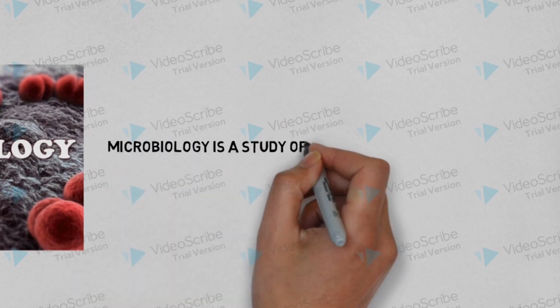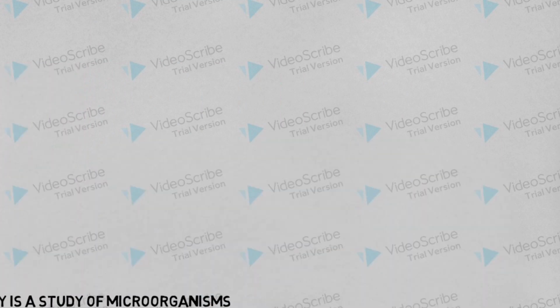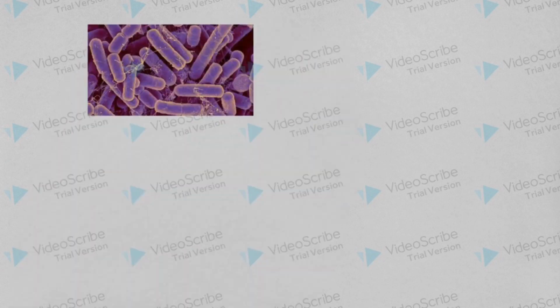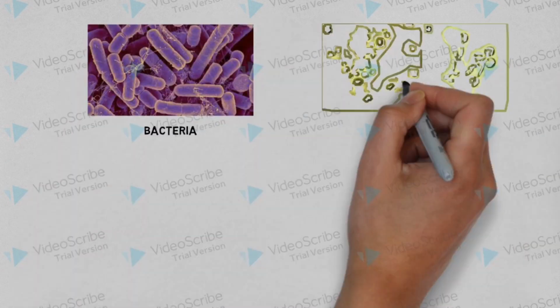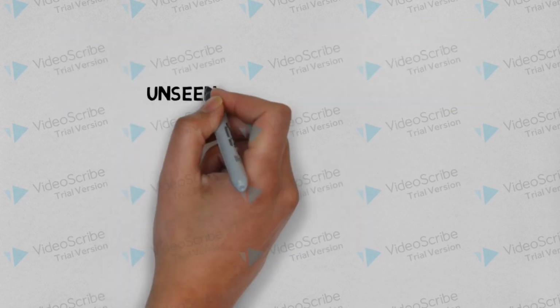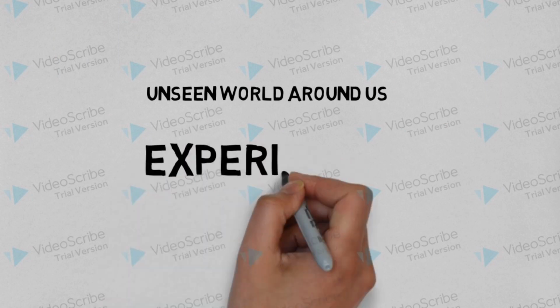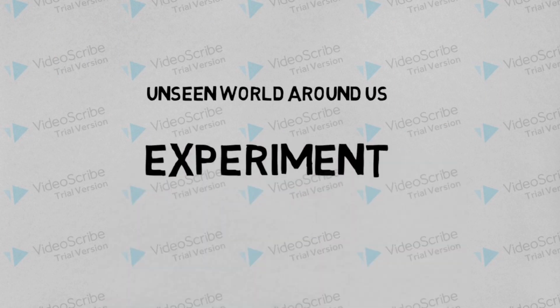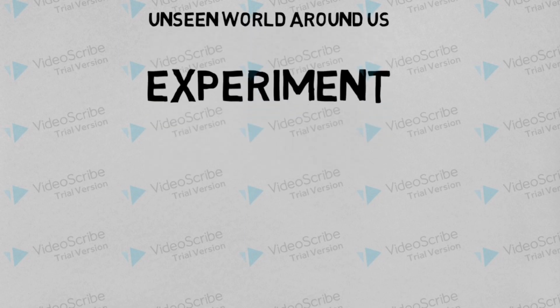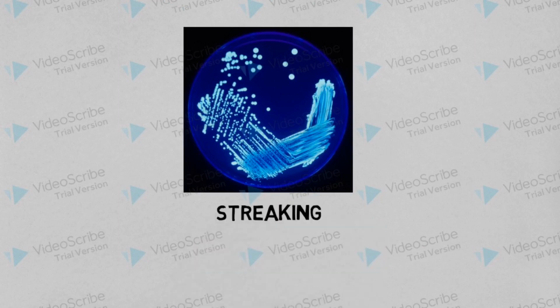Hence, microbiology is the study of microorganisms which are too small to be seen by the naked eye and include things like bacteria, fungi, and viruses. Accordingly, to observe this unseen world around us, I've structured an experiment which may clear some of our doubts. This experiment revolves mainly around three major aims involving many microbial techniques like streaking, sterilizing, etc.